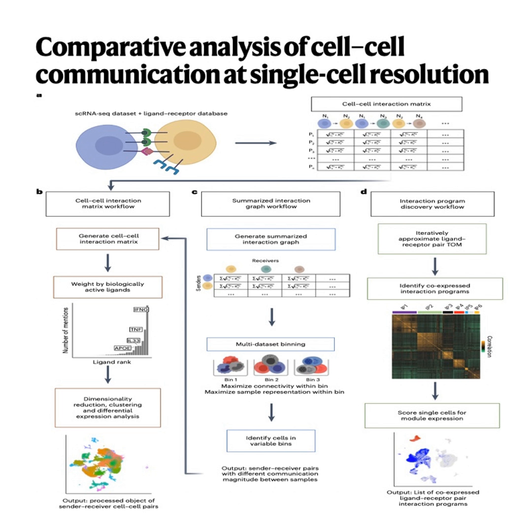Precisely. Then there's a second step. They take the square root of that product. The square root. Why? It's basically a way to control the volume. Imagine you have one ligand-receptor pair where both genes are expressed at astronomically high levels. If you just use the raw product, that one interaction could potentially dominate all the analysis just because it's so loud. Ah, I see. So the square root dampens that effect. It stops the few really high expression pairs from drowning out potentially important but lower expression interactions. Exactly. It prevents those outliers from having a disproportionate impact. So you end up with this matrix, encoding the interaction potential for all cell pairs across all relevant ligand-receptor pairs.